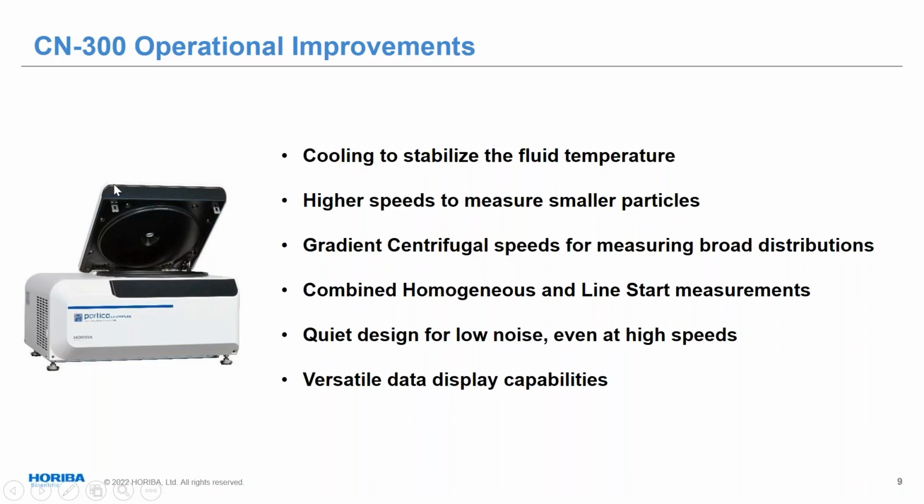Again, the 18,000 RPMs is to do a good job on the smaller particles. You don't want to be standing around for hours waiting for your answer. You'd like to be able to get it quickly. So that high speed helps out quite a bit there.